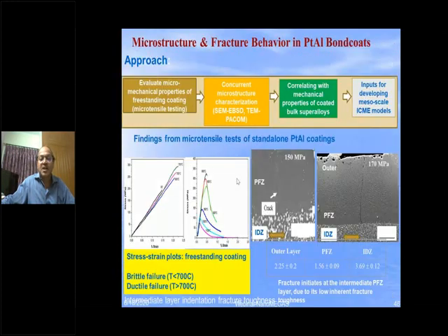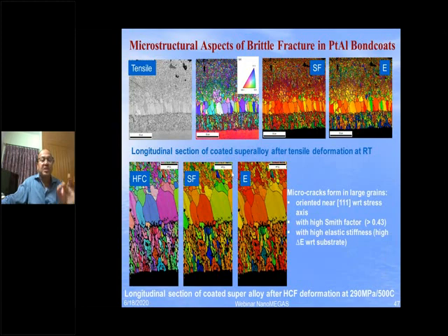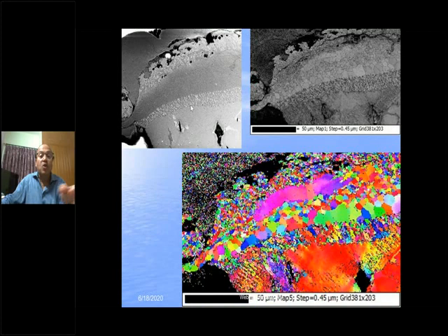So after this coating, so we can understand this particular platinum aluminum bond coat, we need to extract them. That is, we have to find out from this region. This is all EBSD. Slowly we are converging, we are going towards a TEM investigation. If you look at the sizes, they are very fine sizes, which EBSD can do for this part but not this part of it.